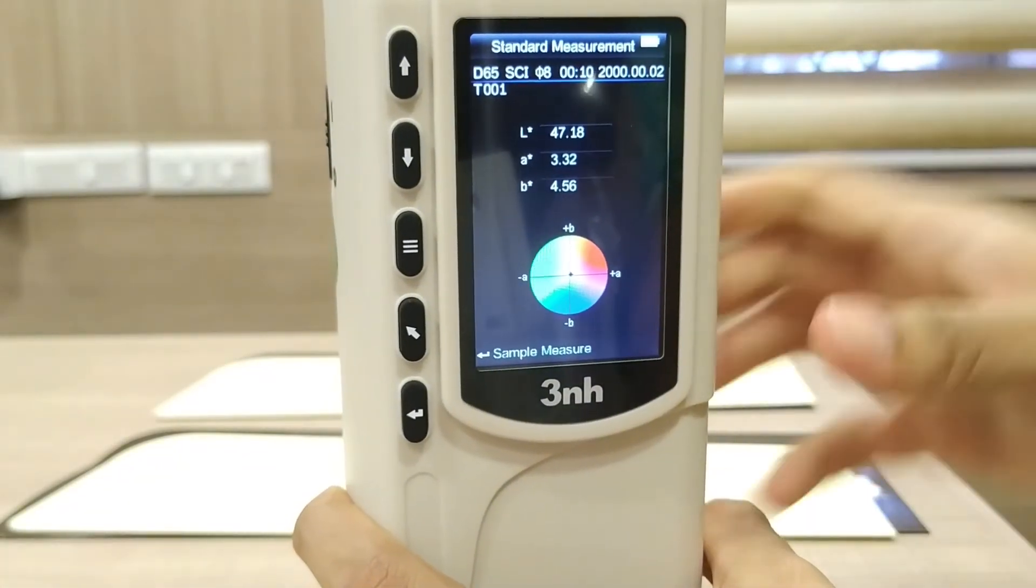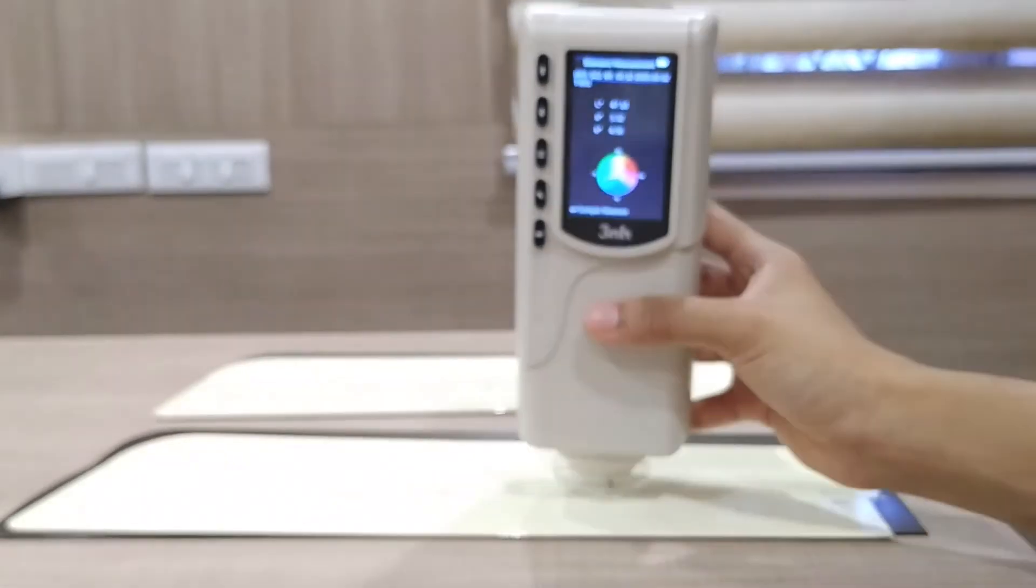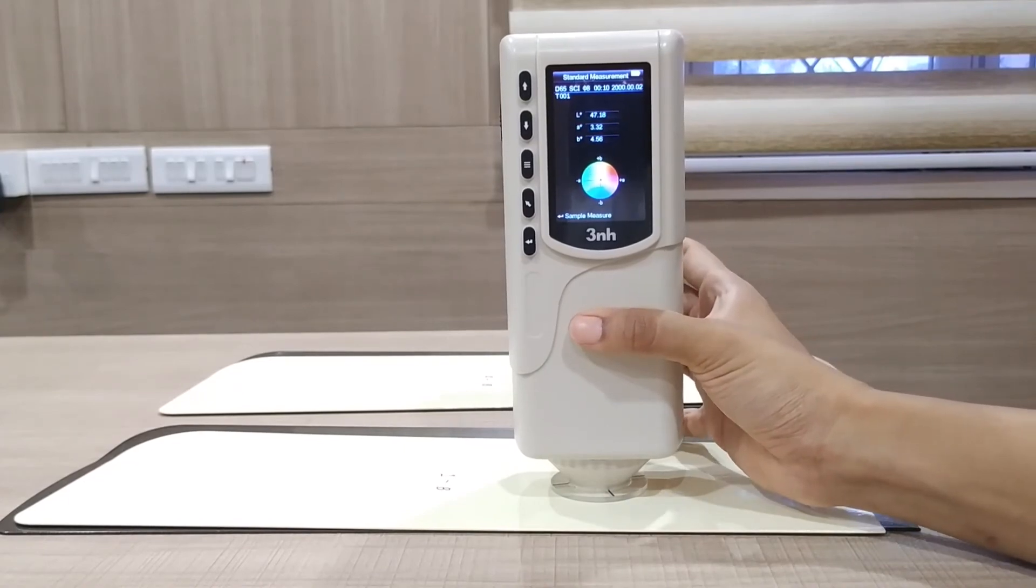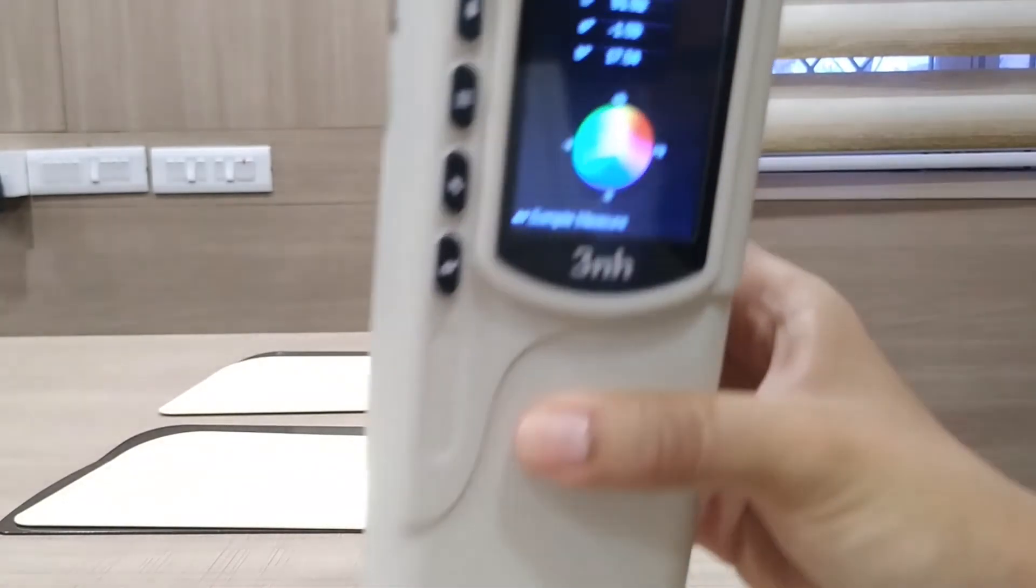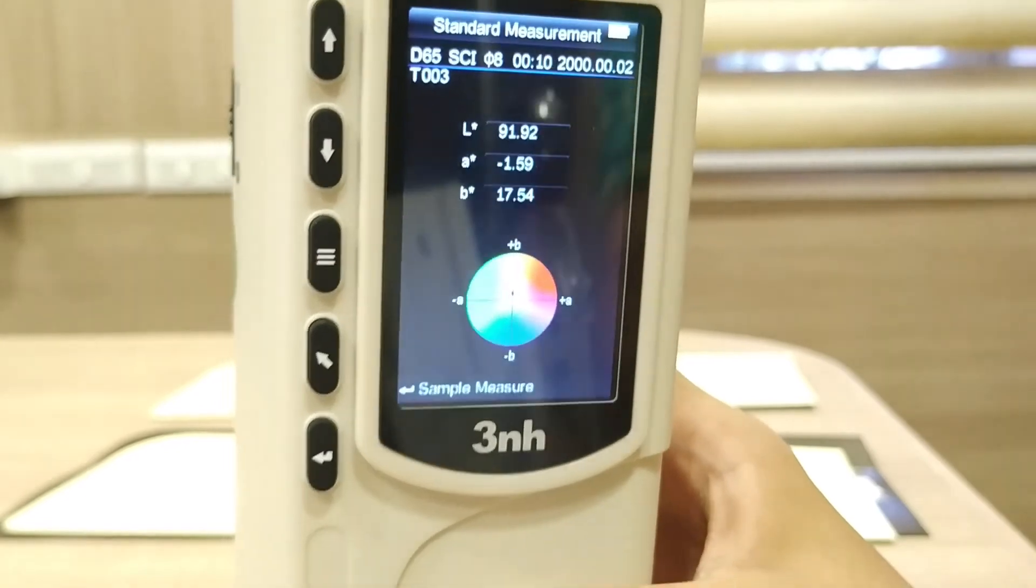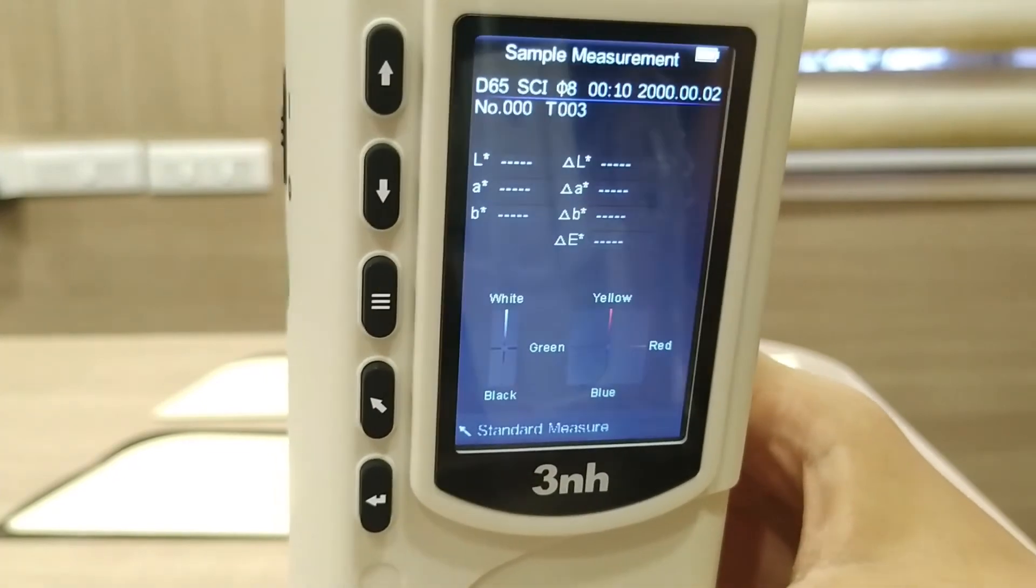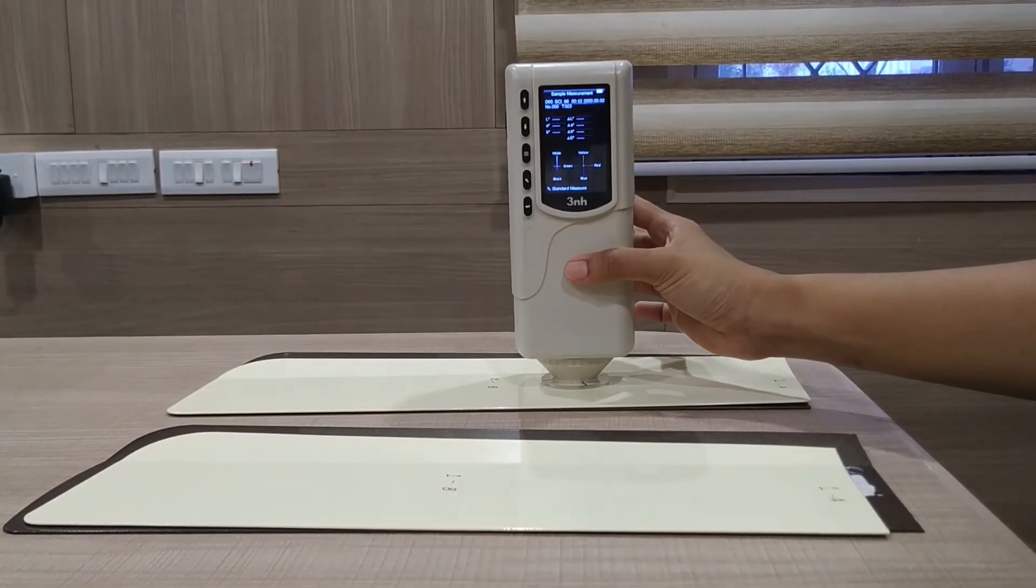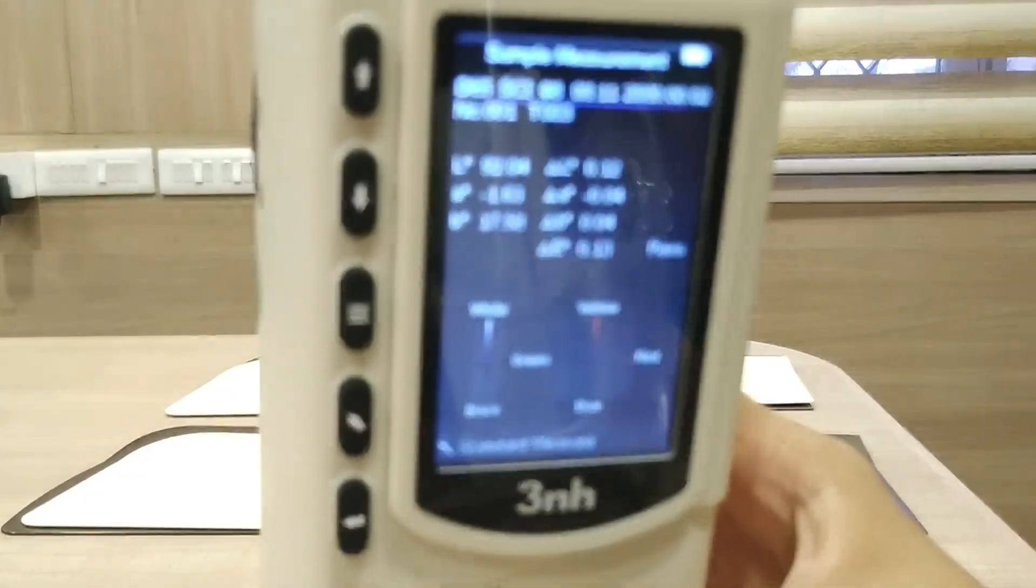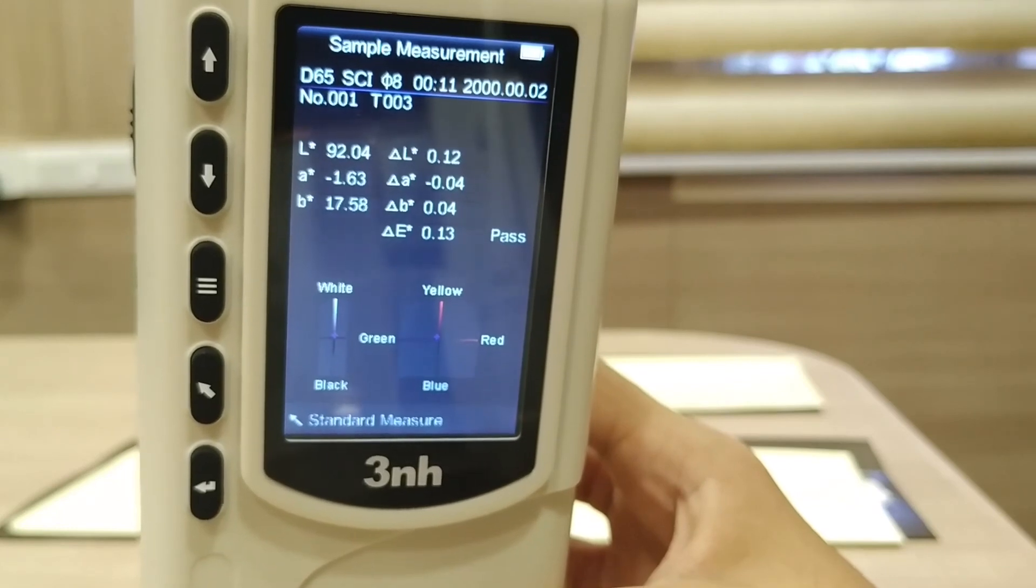Going back to the standard measurement mode. Here I have the standard and the sample, and I will measure the standard. Here is my standard values. And for this standard I will click on this button to measure my sample. Here you can see that the delta E value is less than 0.5, which means that my sample has passed the color test.